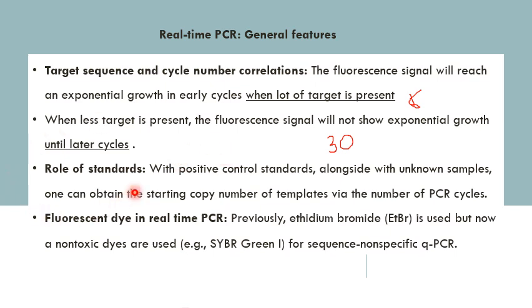You have to make sure to use some standards, positive and negative samples, and positive standards. These amounts of standards are already known, so you can detect the approximate quantification of your sample compared to these standards.